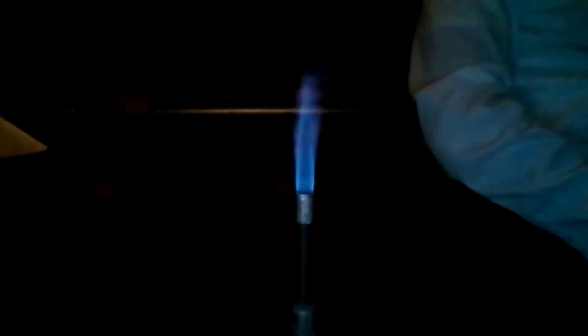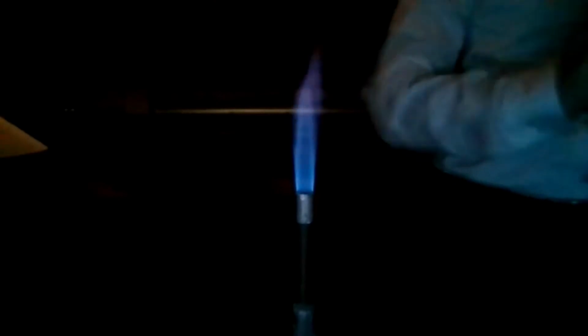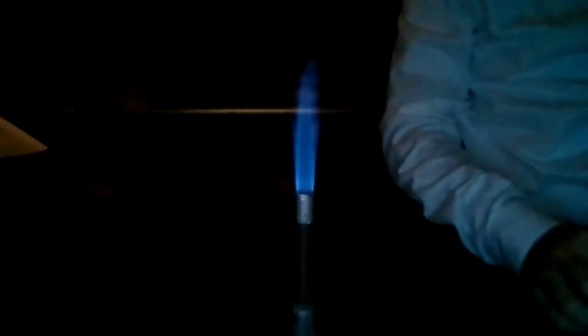Let's see, I think we only have one left, right? Other than the two unknowns. Our last one's strontium, I believe. Yep. And the unknowns. Well, the unknowns are fun. I like those. That's when you have to use science to determine what it is.